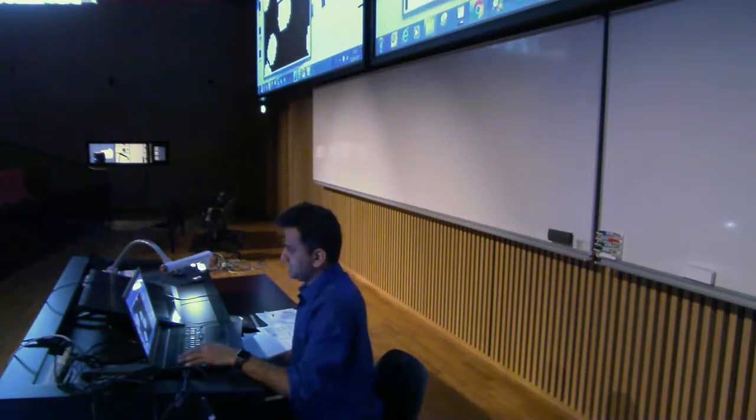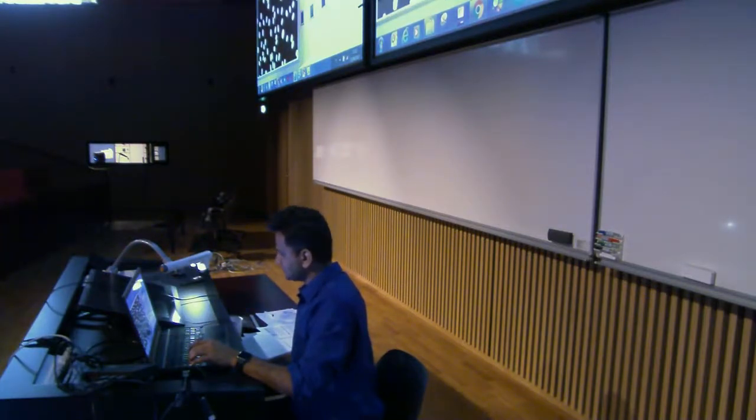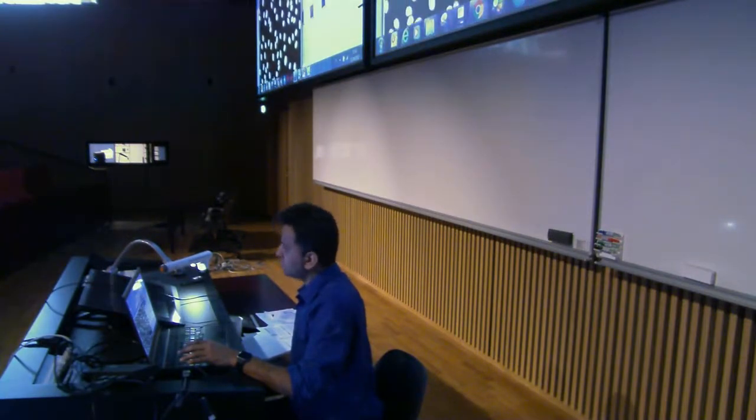Okay, so this is how it has done this watershed segmentation. Again, to understand how the watershed works, go back to the slides. I have explained it very well. We have just 30 or 45 minutes left. So this is all about the segmentation, and then quickly we will make a break, and after that I will explain how to quantify.